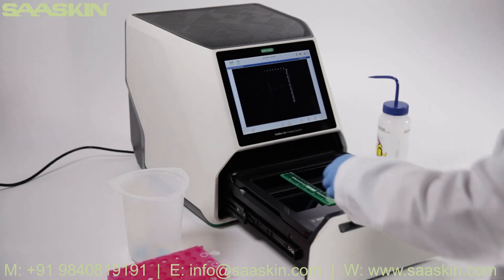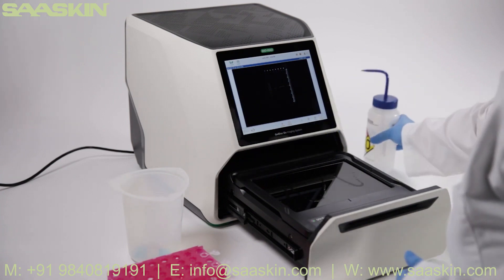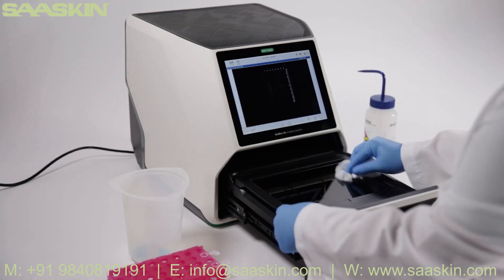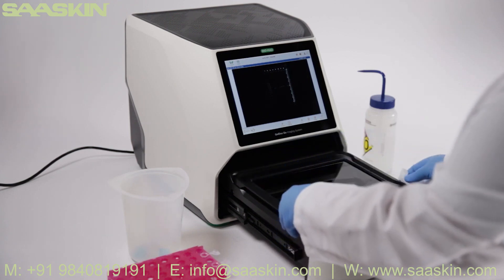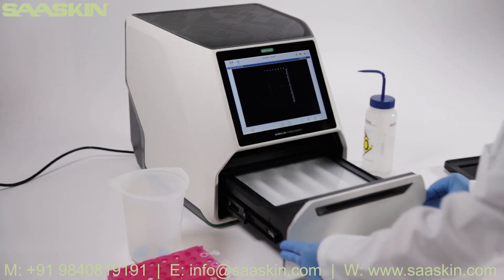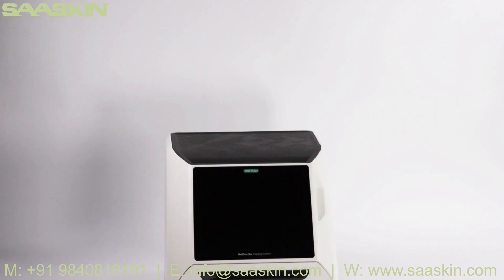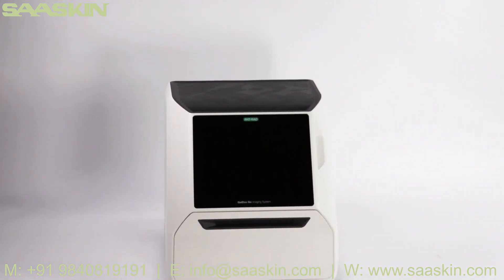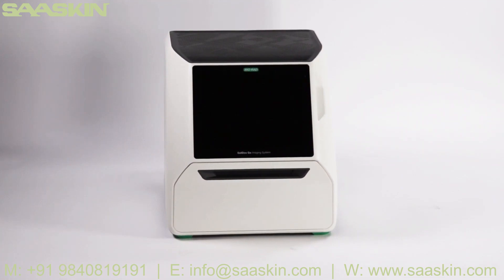Finally, don't forget to clean up. Make sure to remove the gels and wipe down the tray with a lint-free wipe. This will make sure the instrument is ready for the next user. The GelDoc Go imaging system makes band excision on your agarose and polyacrylamide gels quick and easy.